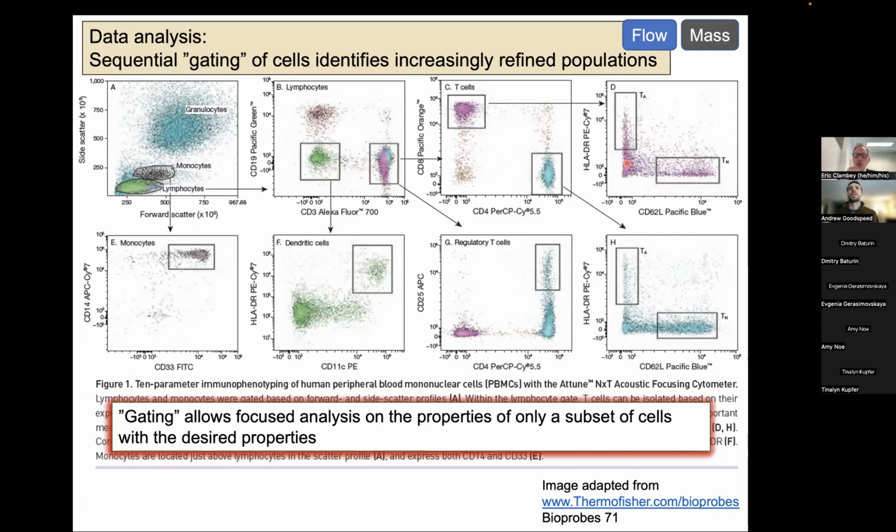Whether you have a sample that's a knockout for your protein target, or whether you have a fluorescence minus one (FMO) control where you can basically drop out this antibody, then you can define the background fluorescence. Those kinds of controls will allow you to assign the specific fluorescence to that antibody and that protein. And without those, some of these can be much more difficult or much more judgment calls.